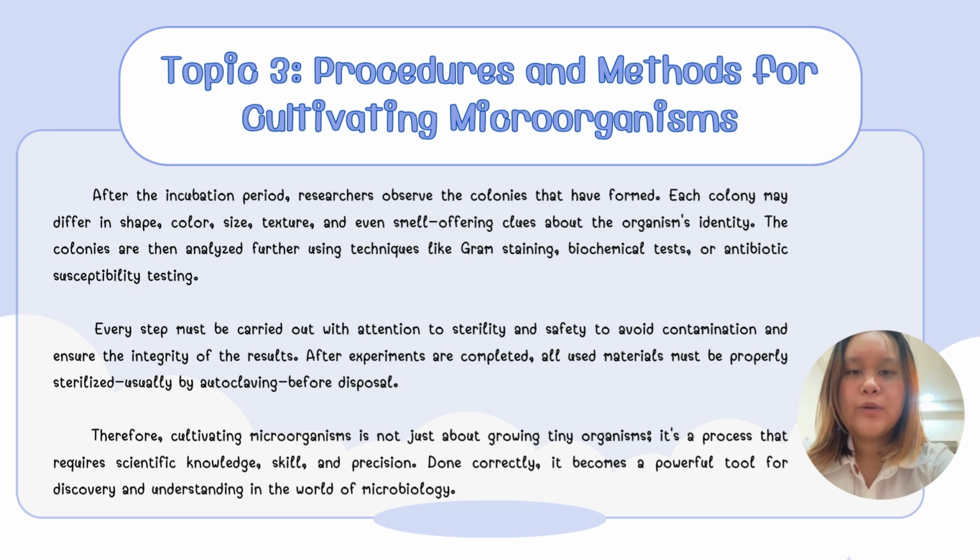Therefore, cultivating microorganisms is not just about growing tiny organisms. It's a process that requires scientific knowledge, skill, and precision. Done correctly, it becomes a powerful tool for discovery and understanding in the world of microbiology.